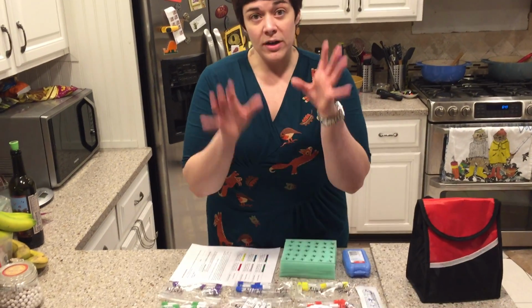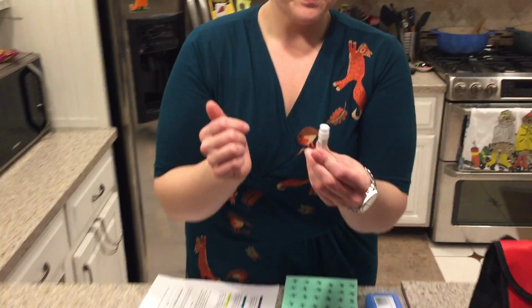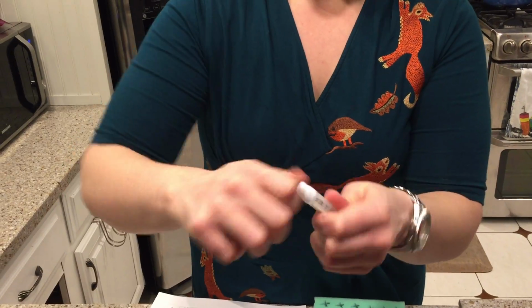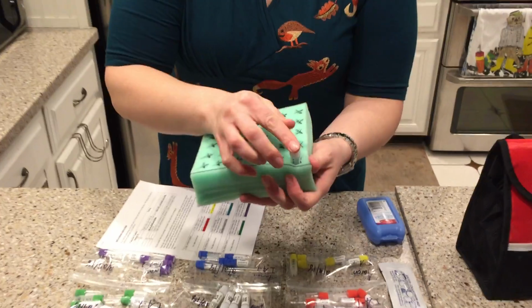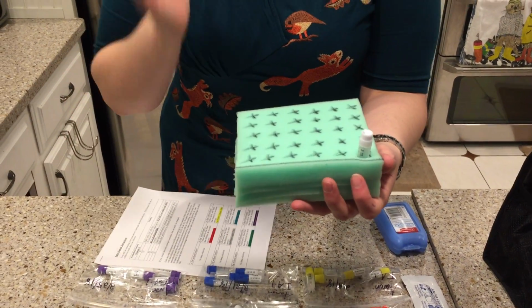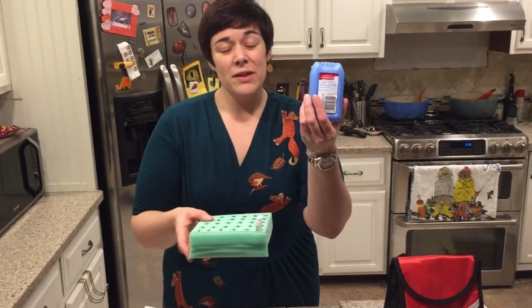Once you spit into the tube, and I will show you how to do it, you want to make sure the cap is on very tight. Really tight cap. You're going to jam it into the foam block that you have right there. And if you have the ability, this should go straight into the freezer if possible. If not, that's why there's an ice pack.